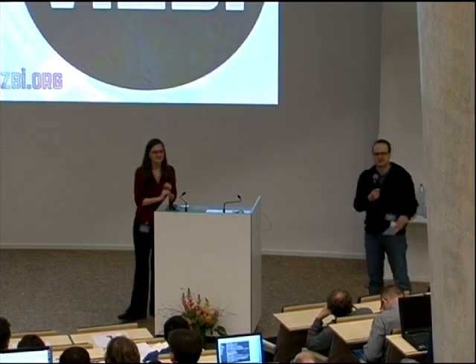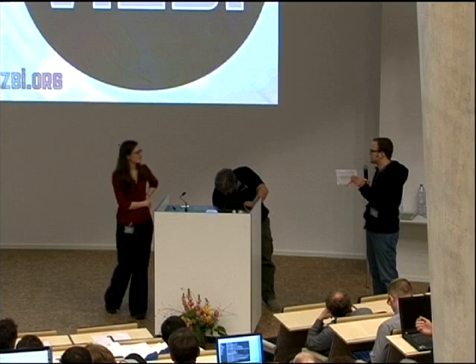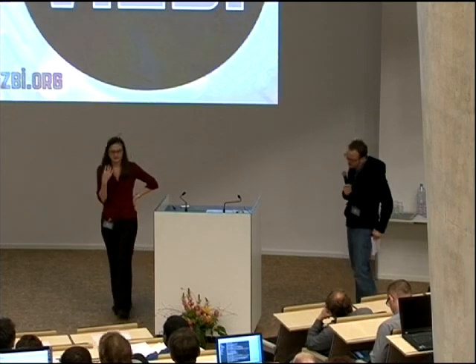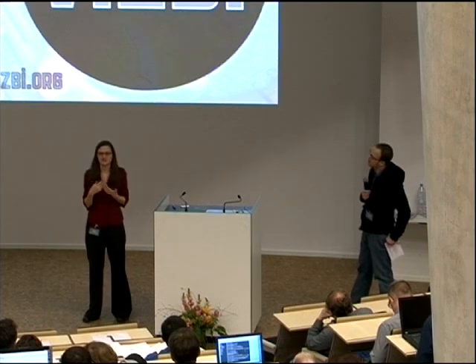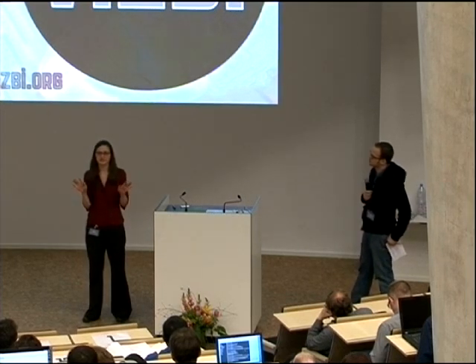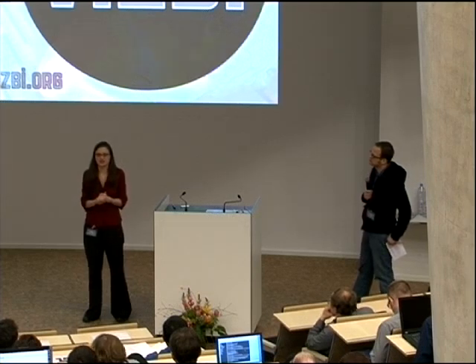Okay. How can a computer manage to quantify things you can't really see as a human expert? It's actually not that mysterious, because the human brain is not perfect. There are certain optical illusions and things that we're just not tuned to identify. For example, if you look at 100 cells of this type and 100 cells of this type, and one is maybe 10% larger than the other, you may not notice that by eye, but the computer can very easily detect that. Even if it's 2%, if it's consistently 2% larger, it can detect that.